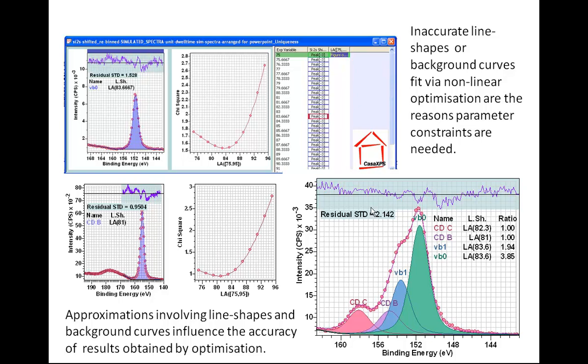Now we have a situation here where these are data that have been constructed, so we know the number of components, same as in the previous example. There are 4 components. We know the relationship of these components in reality, but we do not have precise synthetic line shapes that match the data for these individual components that were previously fit to the data envelope.